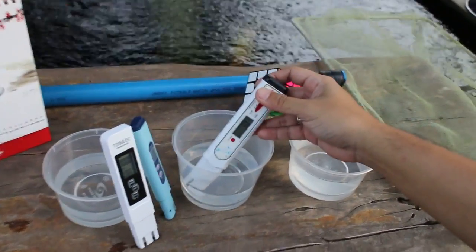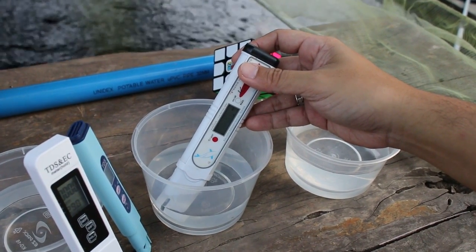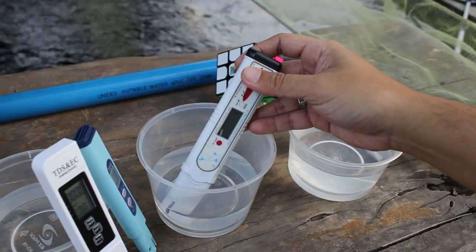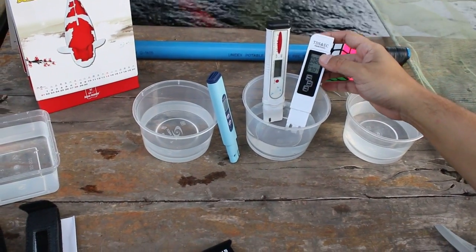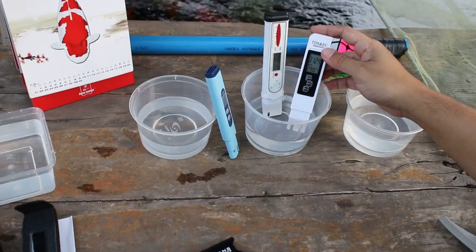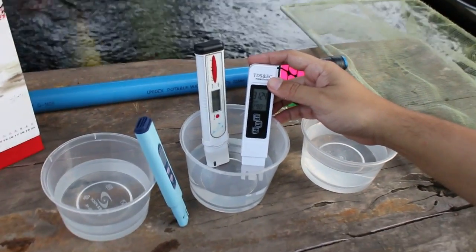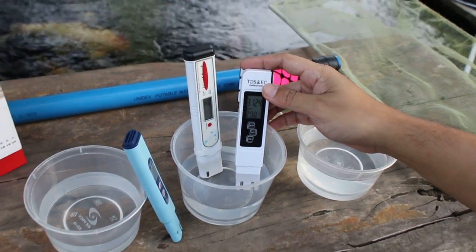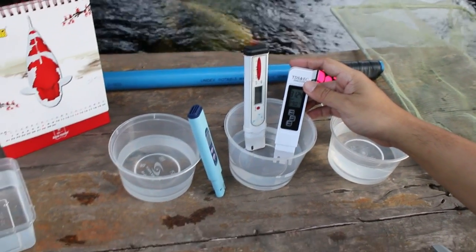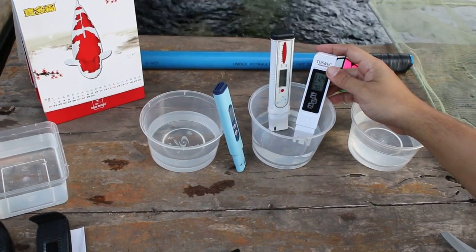Let's see what reading it's going to give us. 3,124 parts per million, or in parts per thousand this will be 3.12. Quite near to 3.0, no? 3.0 to 3.12, it's quite near. The figure is quite near.